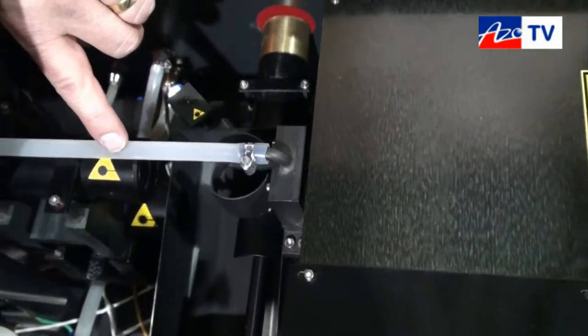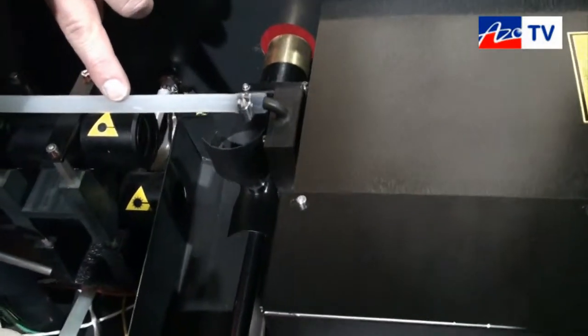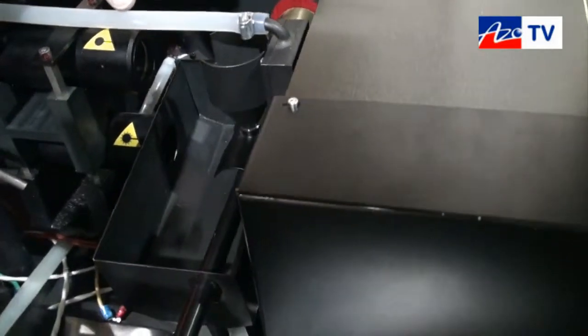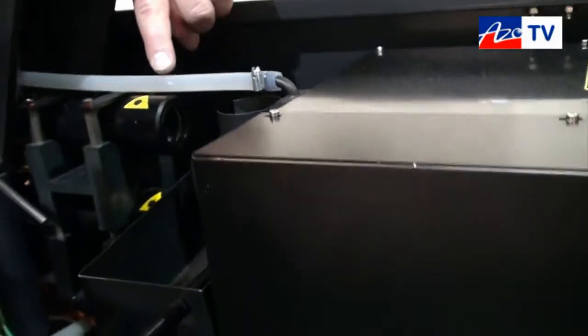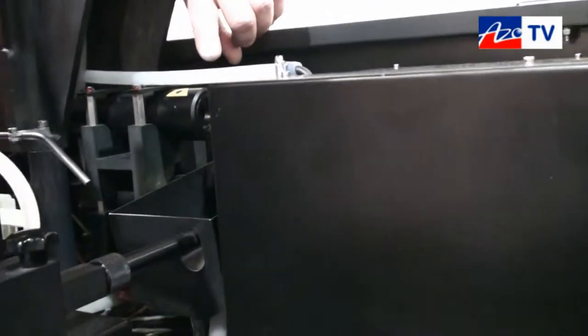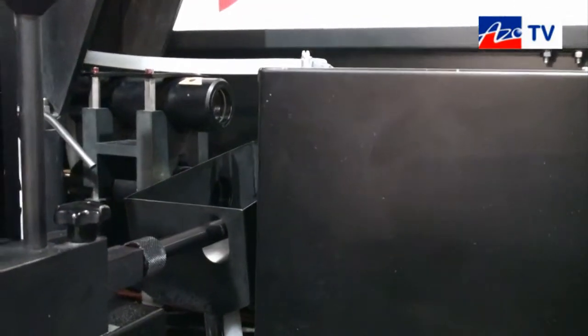So our capability on the 1190LD is from 40 nanometers up to two and a half millimeters without the change of optics or dispersion modes or modules to make a measurement on that wide range of analyses.